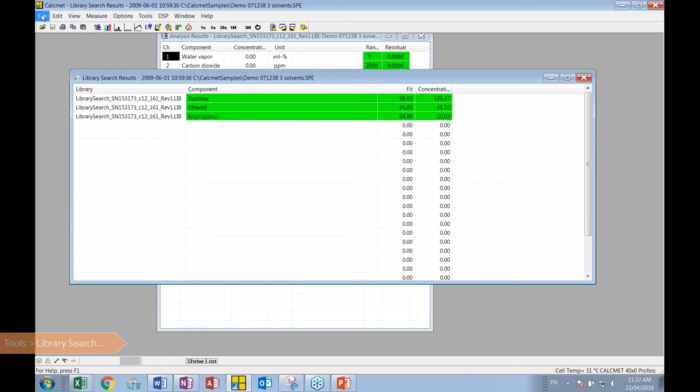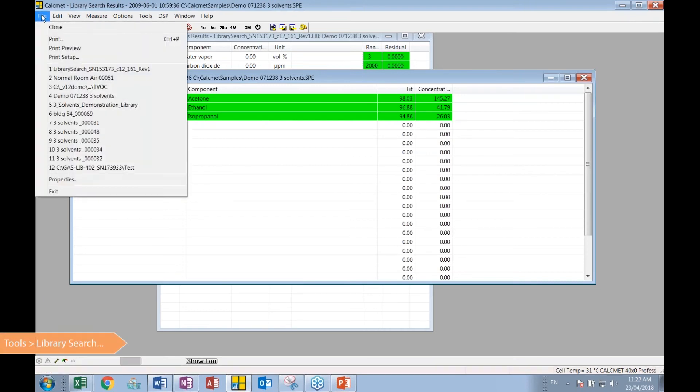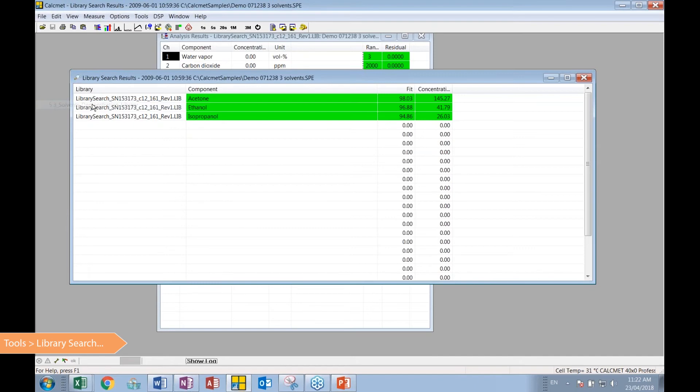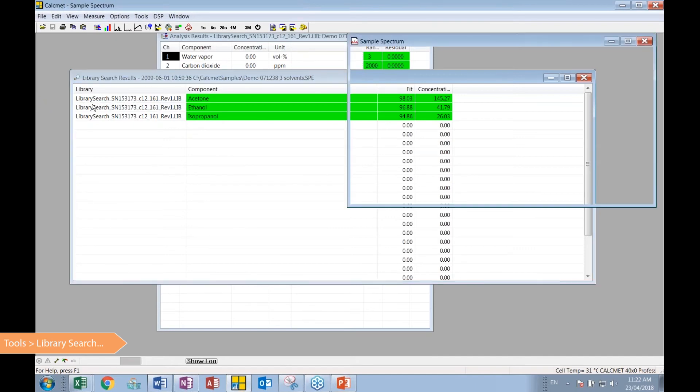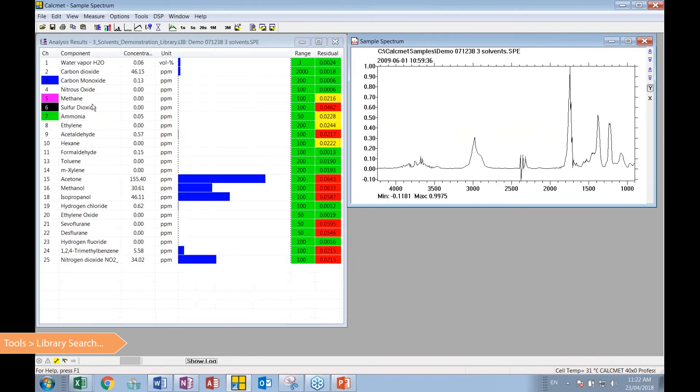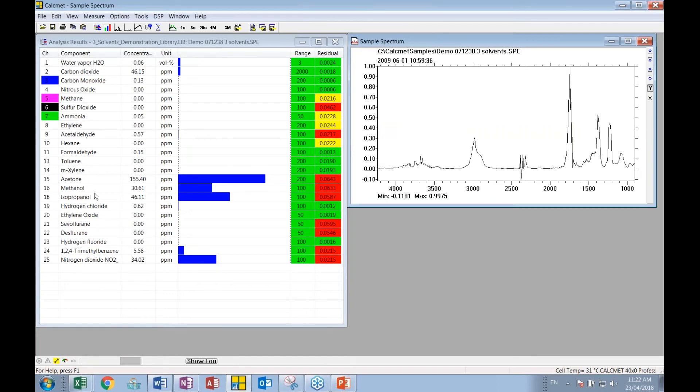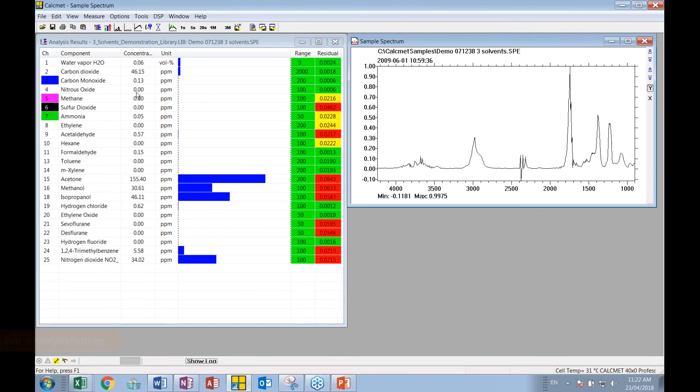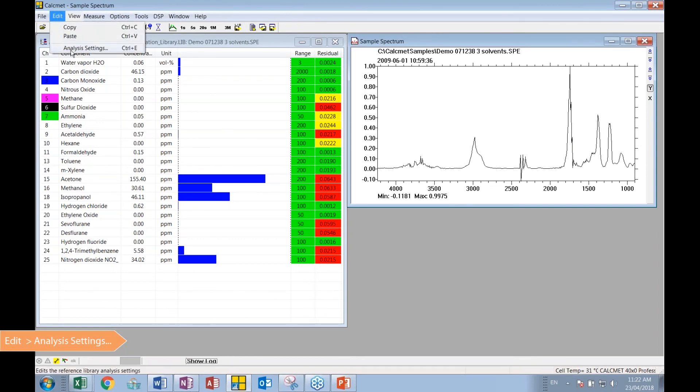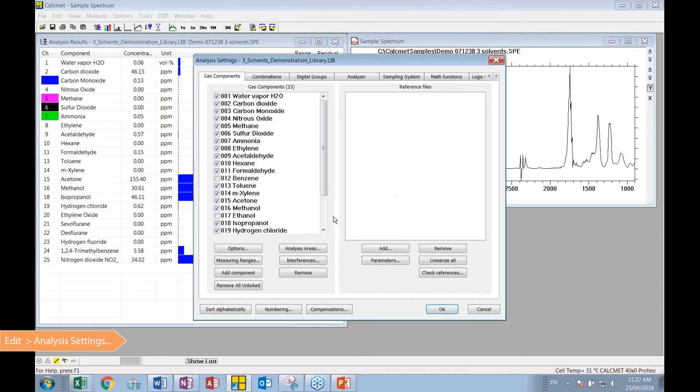So with that information, the user can go back to their original application library. Again, we're not changing the sample. The sample is staying constant and can look their way through and say, there's our acetone. Yes, we have the acetone, isopropyl alcohol. There's methanol, but the third gas it pointed us to was the ethanol. So let's add ethanol to our application library.